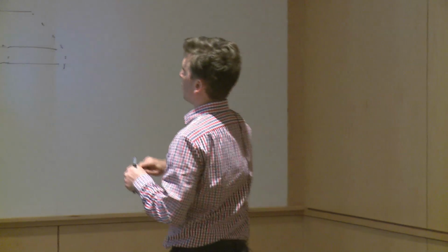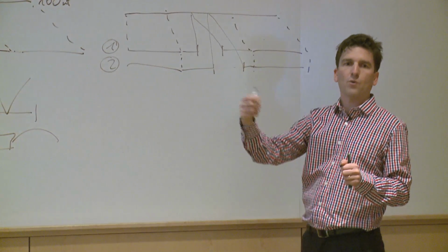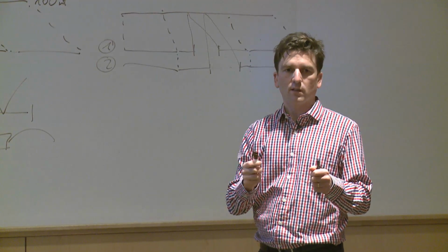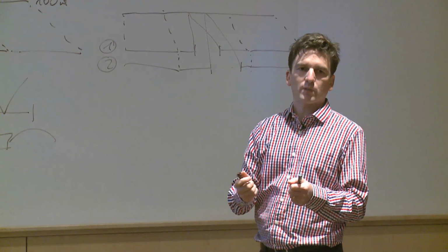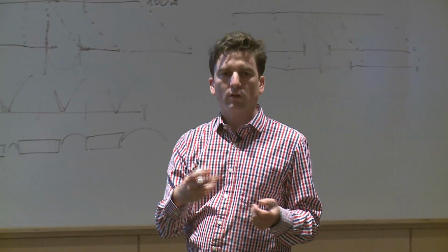If one of those 2 choices corresponds to an annotated site, it would probably favor the one that is already known. So that's based on the annotation, not so much on the canonical splicing site. But for equally likely alignments, it would favor the one that corresponds to a canonical site.